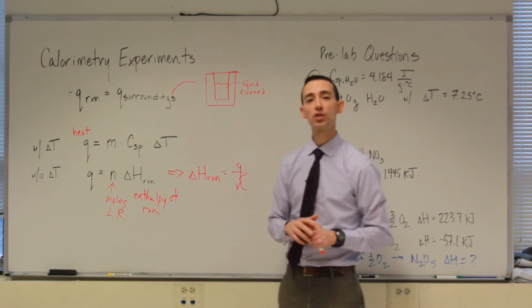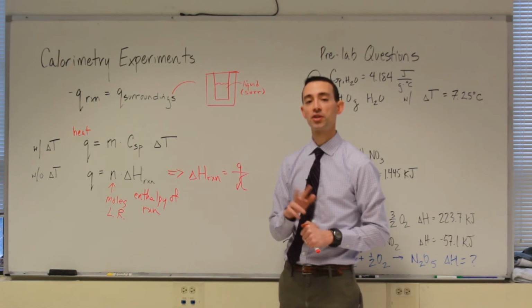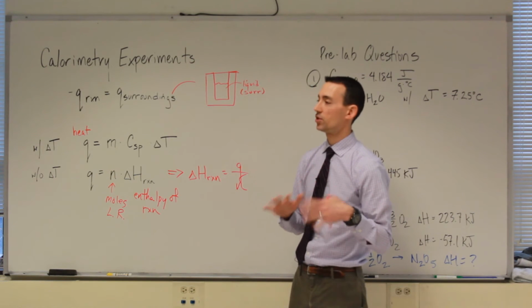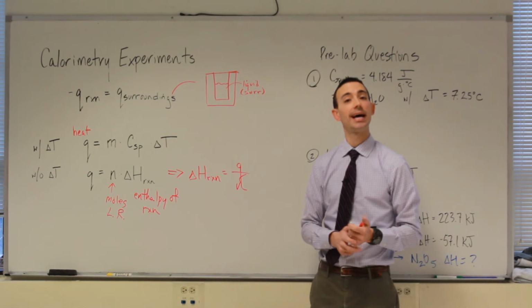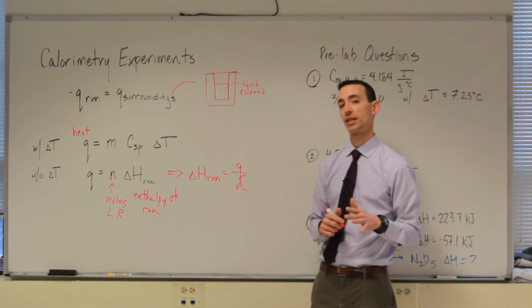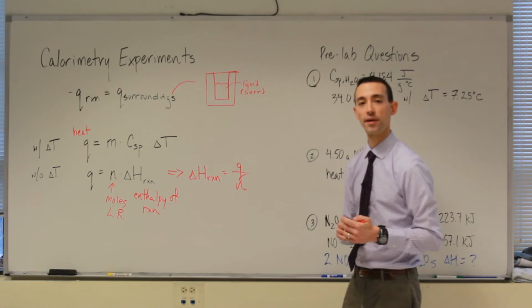And 2 of the reactions will also produce hydrogen gas. The 2 metals produce hydrogen gas when they react with the acid, and so that hydrogen gas will be vented. We want to make sure that we absolutely have no sources of flame in the lab today, since that hydrogen is flammable. But there's no use of Bunsen burners anywhere else in the lab today, so that should not be a real problem that we have to worry about.